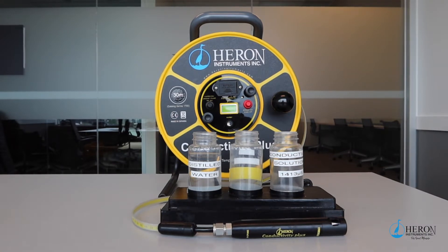All brands of conductivity instruments need to be calibrated before ever used to avoid false readings. The probe that takes the readings is prone to collecting dust, grime, water, residue from other wells, etc.